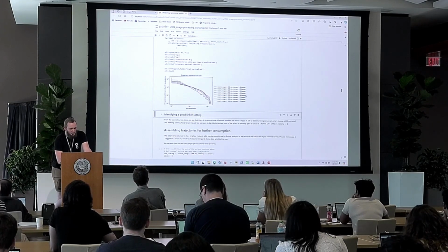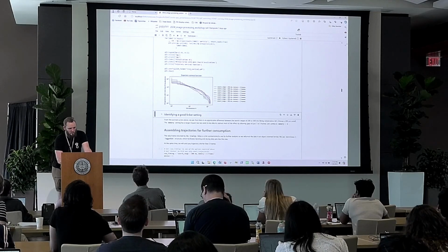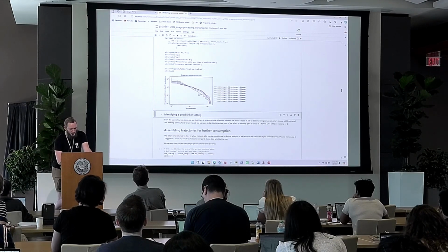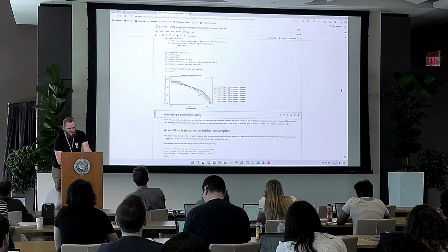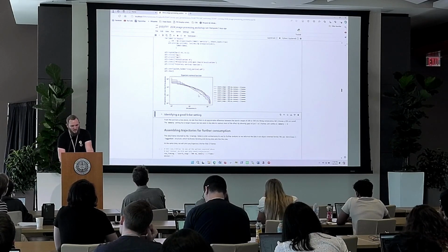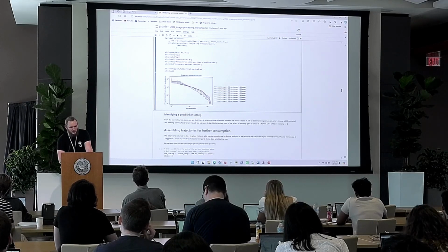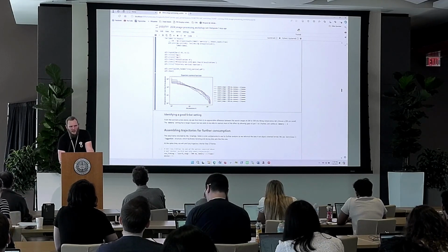The thing that does make a difference is the memory in the linker. Here I pointed out the curves without any memory, where we only accept really contiguous trajectories, and if we accept a gap of 1 frame, this curve jumps up a little bit, and we get a few longer trajectories, which is nice. We generally want our trajectories to be as long as possible. And you can see if we allow the memory to be even longer than this, it converges. So at some point it stops mattering too much.